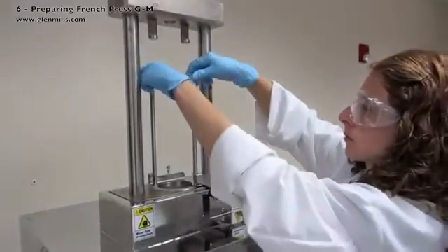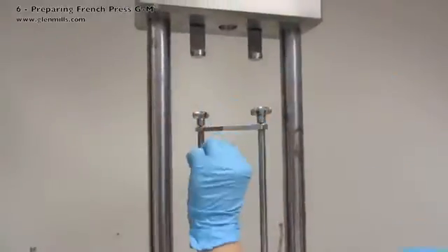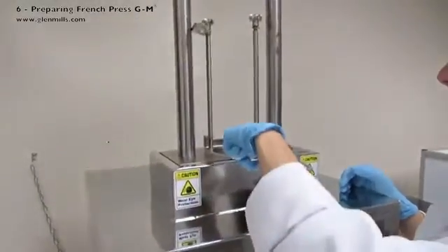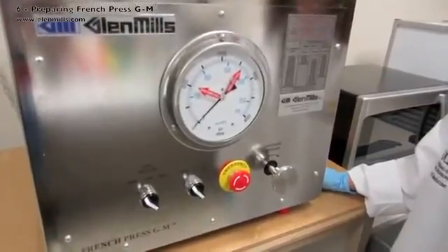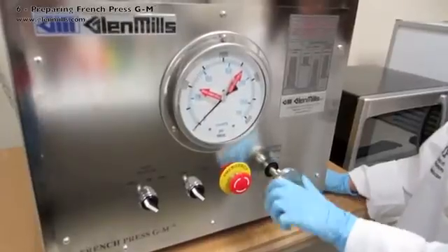Loosen the thumb screws and move the safety clamp to the side. Be sure the platen is clean and level. Start the protocol with the pressure set to zero. The pressure increase valve should be in a low pressure setting.